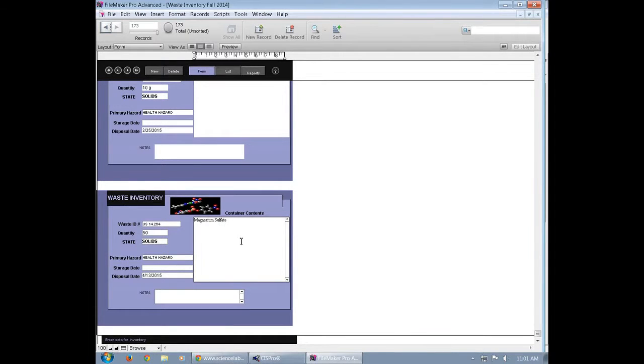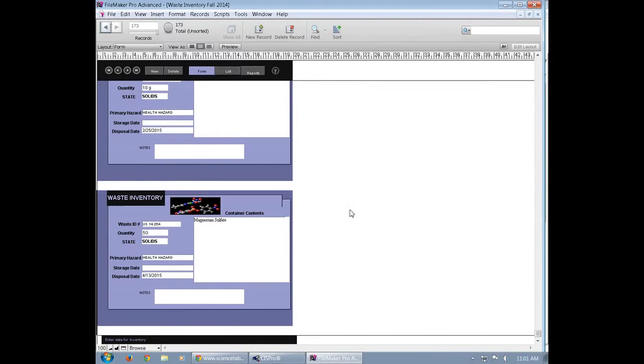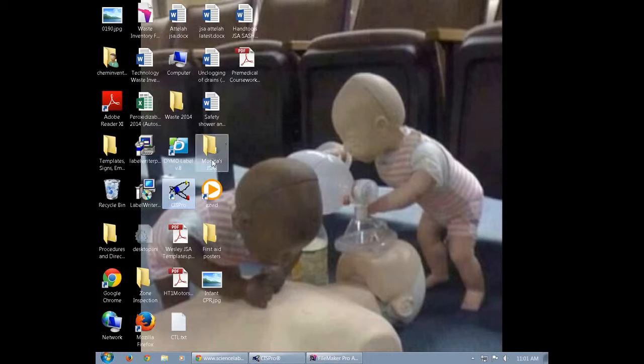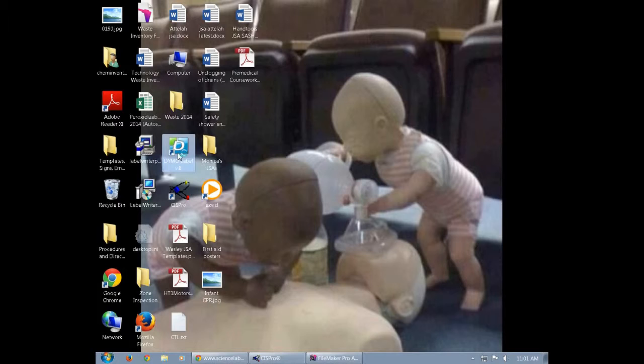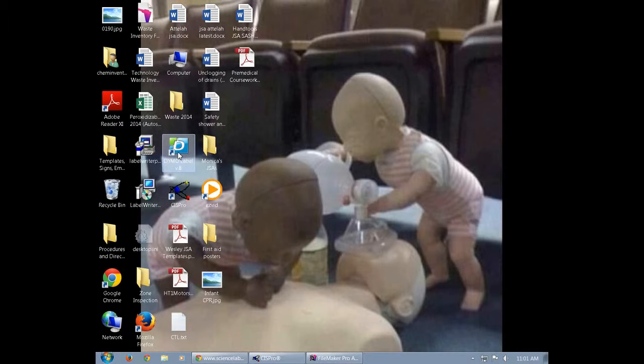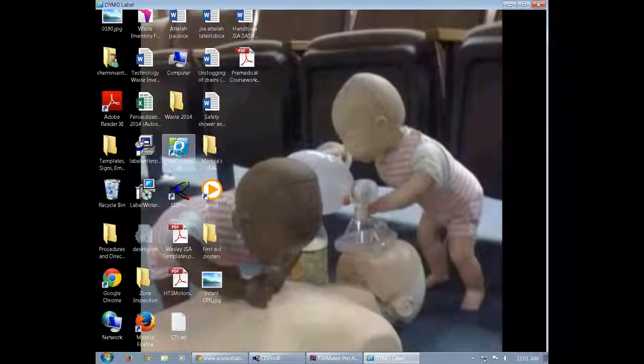After you do that, you're going to need to print off a sticker with the waste ID on it that you can put on the chemical. So you're going to go to the DYMO label printer. And once the DYMO label printer opens up, you're going to modify the sticker template.